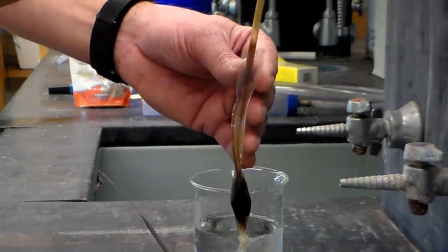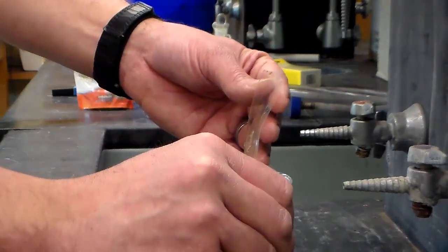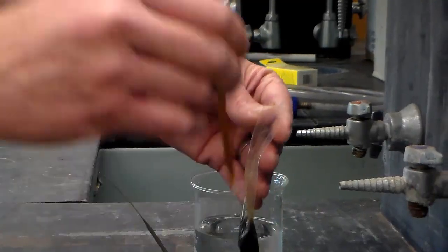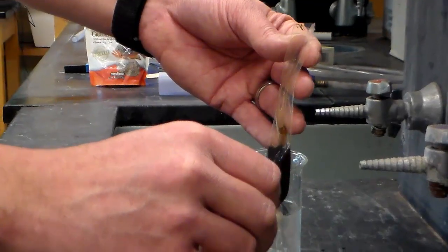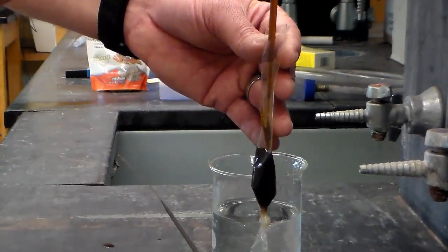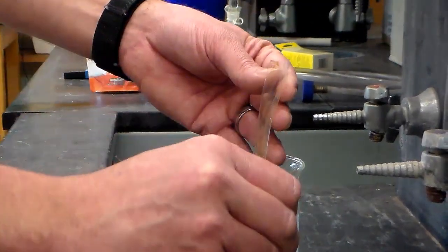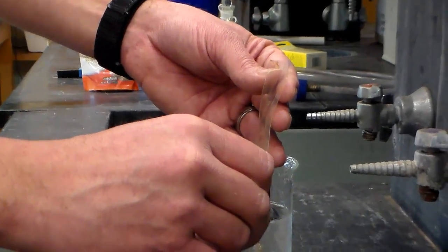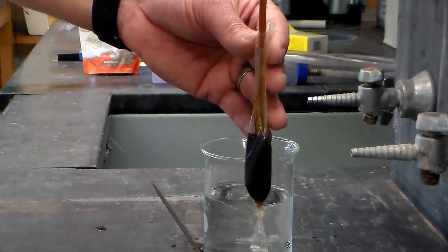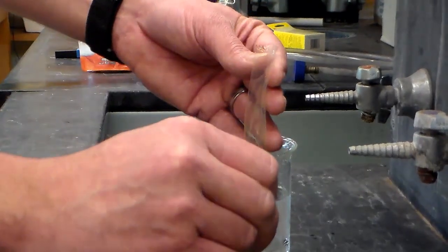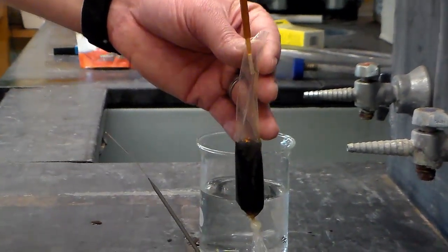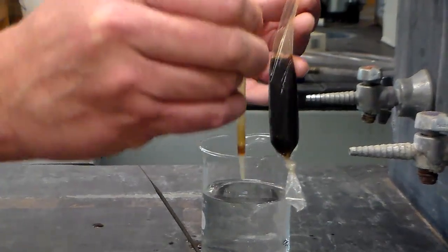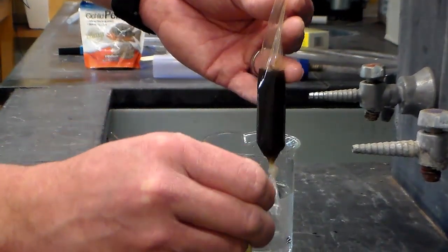...into the dialysis tube. Everyone asks how many mils and I don't have an exact answer, but you want to get it about half full. We don't need it to be completely full until it's bursting, and that looks pretty good right there.